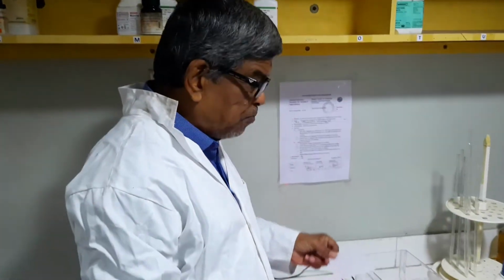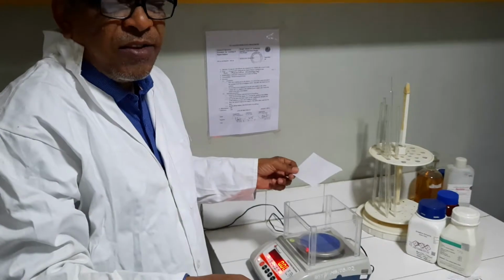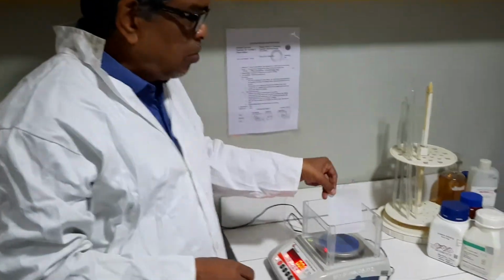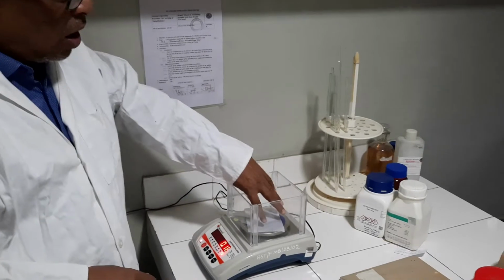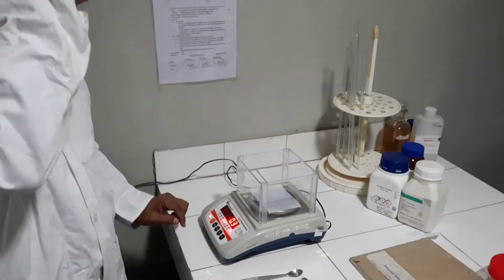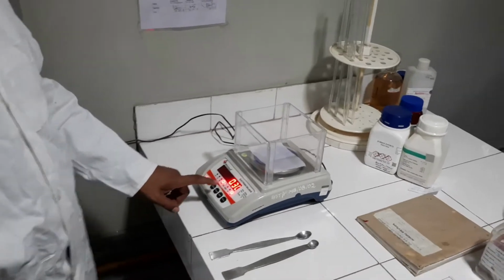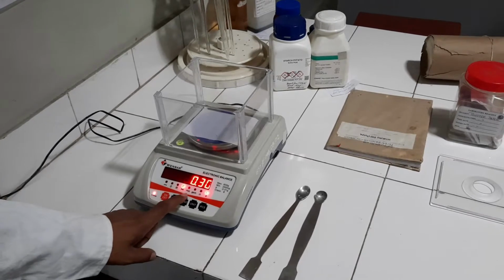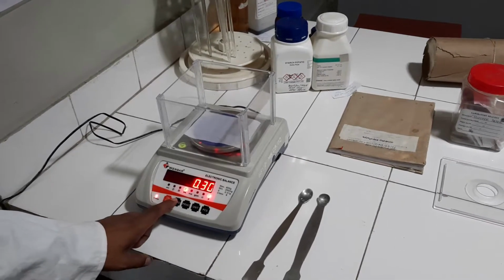Good morning, students. Here I am going to show different ingredients for the preparation of liquid media and also solid media. The first step is weighing. This is a single pan electronic balance. Here we set 0 by taring. It shows that the butter paper contains 300 milligram.